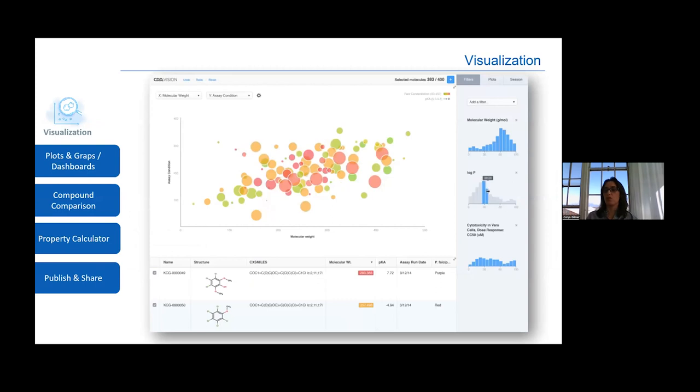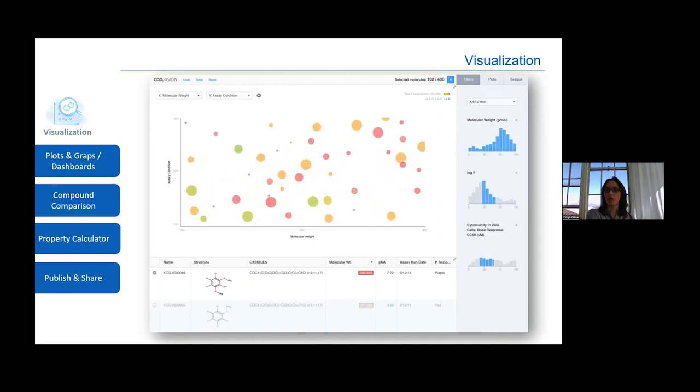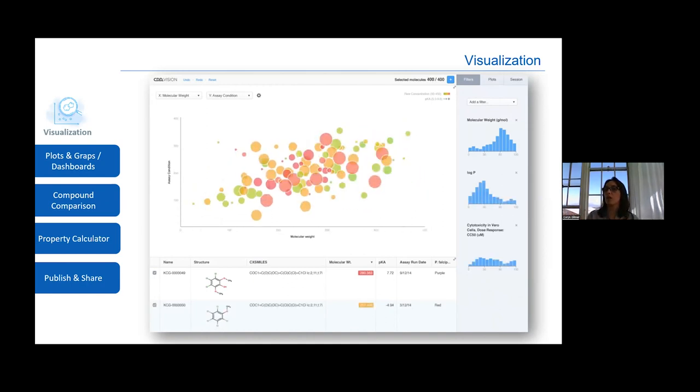The third module is visualization. Visualization is a very dynamic tool, and this is actually where analysis happens. Based on the data that you have entered in the entity registration system, you plot your graphs and you look at your molecules, outliers, or what are the most promising molecules, what are bad molecules.